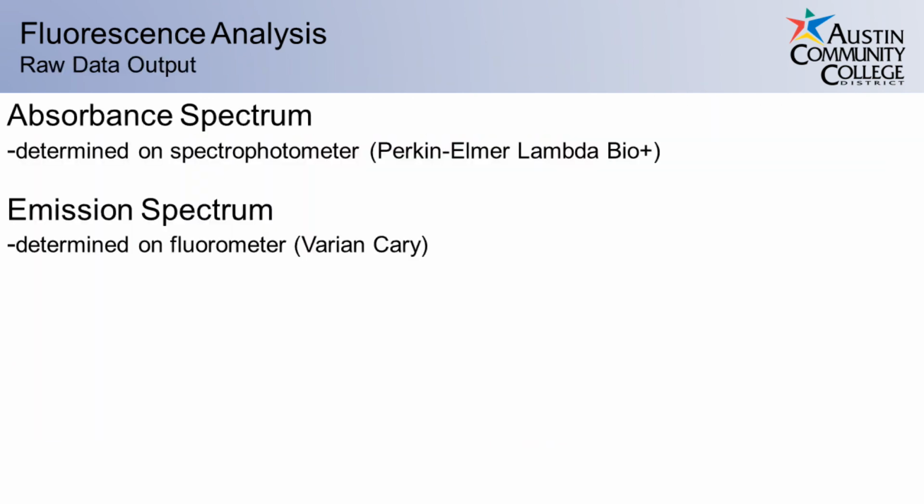For each sample you prepared, an absorbance and emission spectrum will be produced. These spectra will be used in your data analysis.